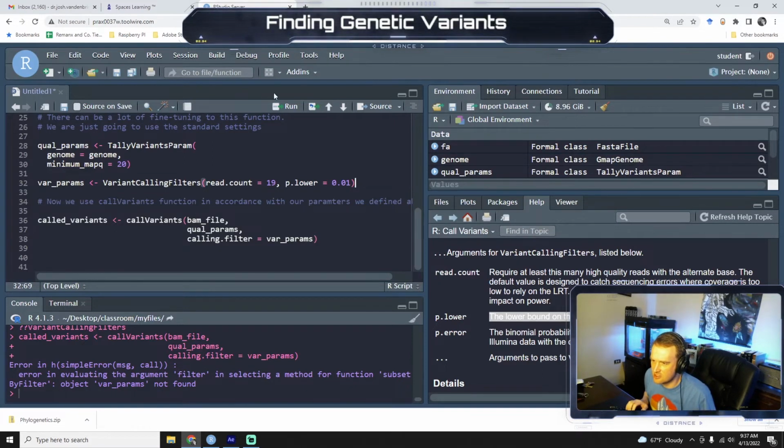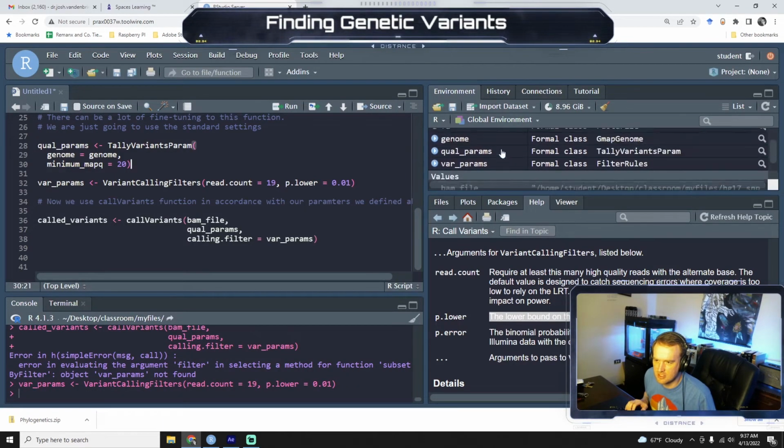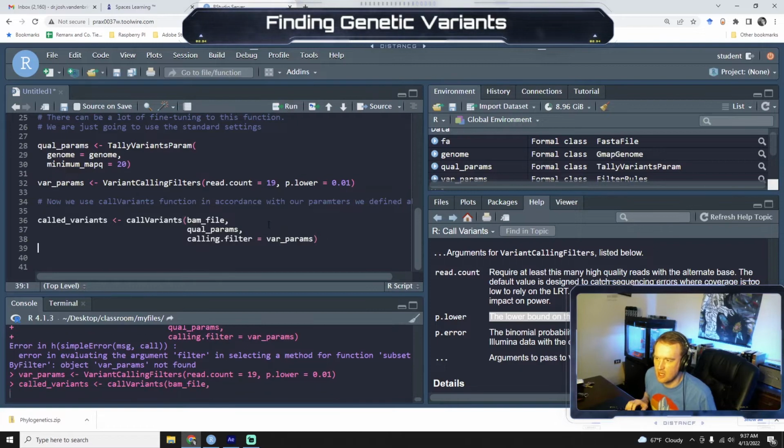Did I not call this first? Did I call qual params? I did. Oh, so I just didn't run var params.